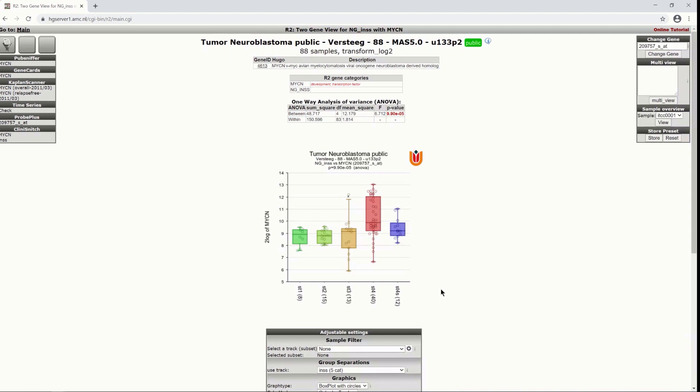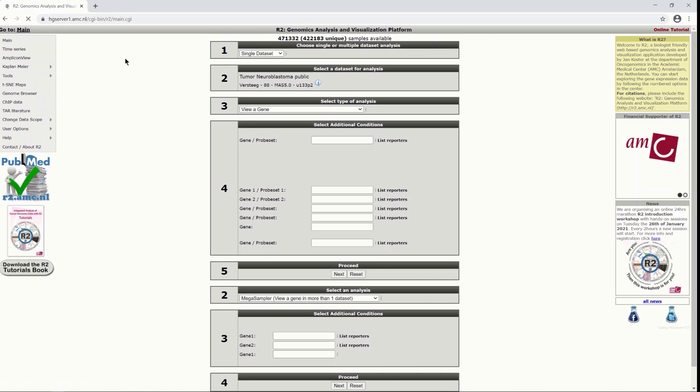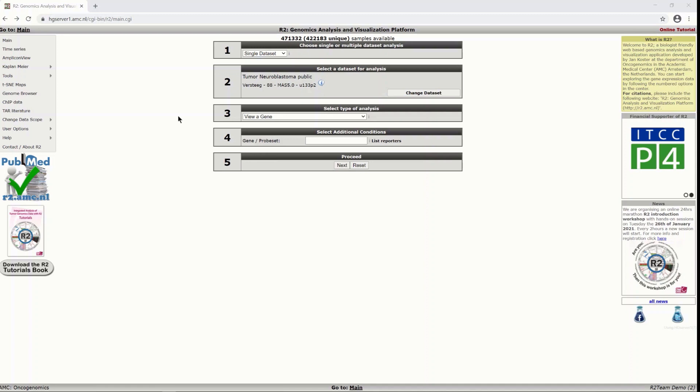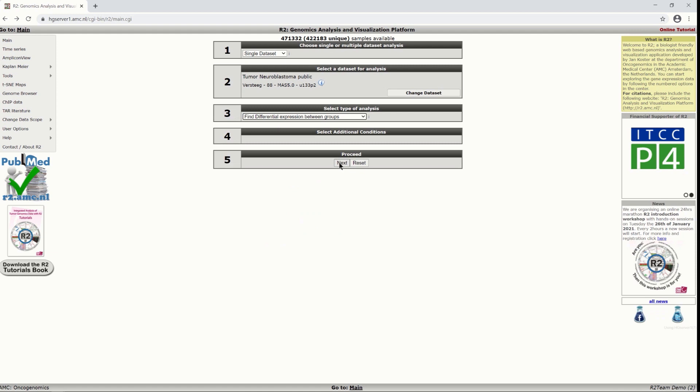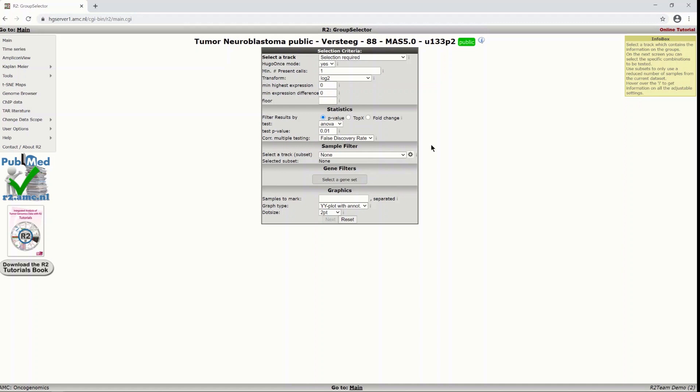From here we go back to the main page to look at another module. When you are interested to find the genes that are most differentially expressed between groups it might be a very tedious job to look at genes one by one. So in R2 you can find the module find differential expression between groups and that will do a test to find the most significantly differentially expressed genes for you.